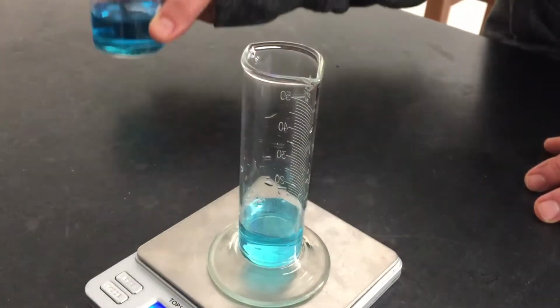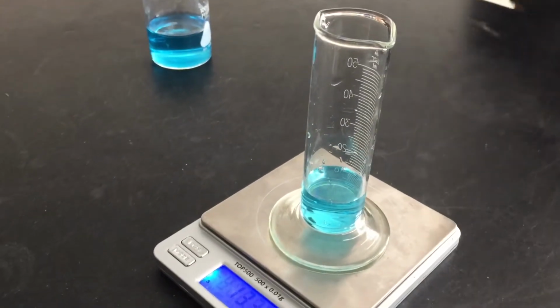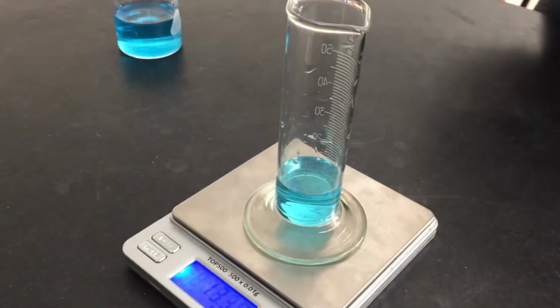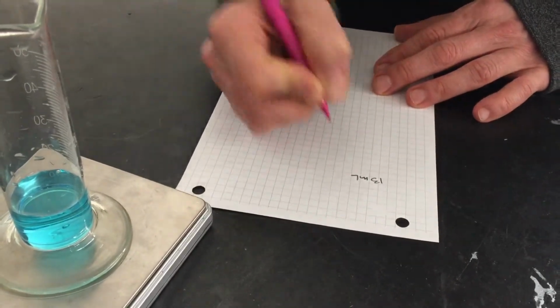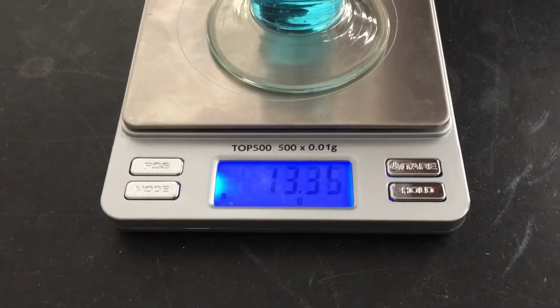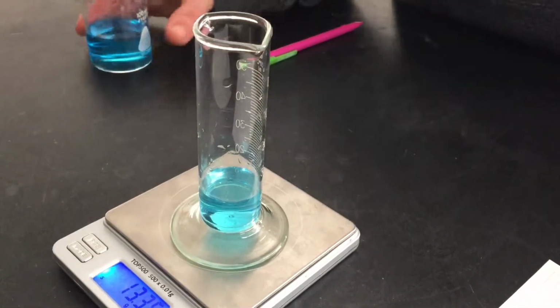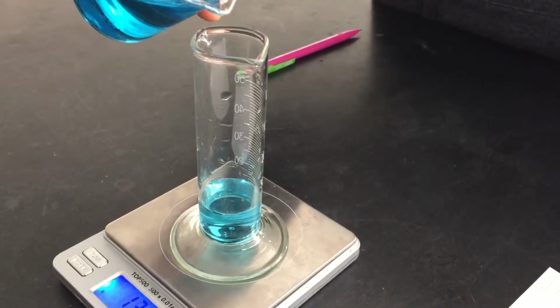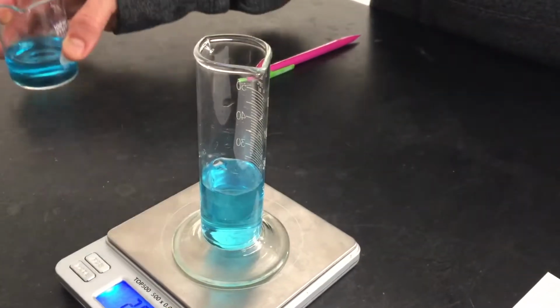So my first volume is actually exactly 13 milliliters. So 13 milliliters, it's upside down for you, I apologize about that. And I record the mass, which is 13.35 grams. Now the next step is, you don't need to dump out this. You just add a little bit more to it and take your next measurement. So we want to take about 4 or 5 measurements total.